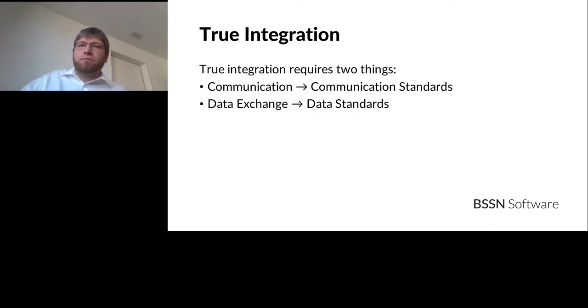So if I want true integration, I need two things. We've established that. I need communication, and for communication, I use communication standards so that I don't have to write a separate driver for each instrument. And for data exchange, I use data standards so that I don't have to pass a different data format for every instrument that I want to receive data from or send data to.